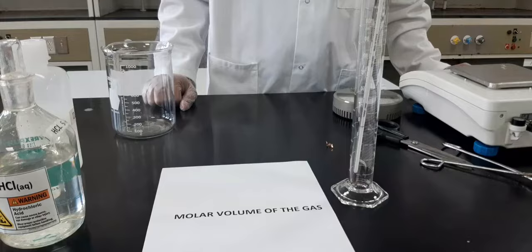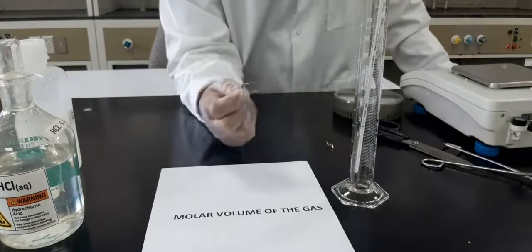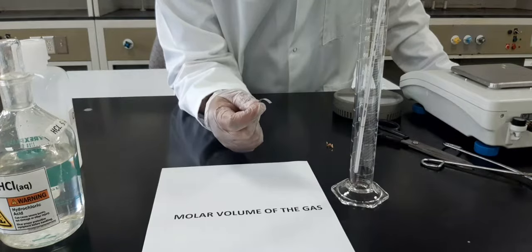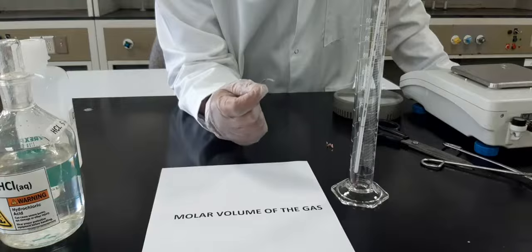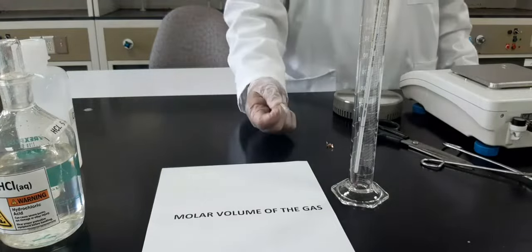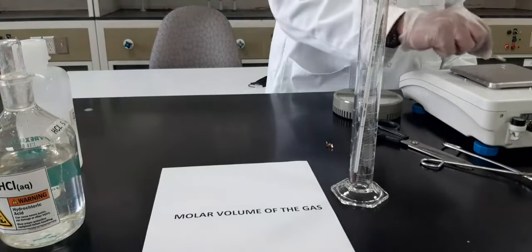First of all, you need to find out the mass of the piece of magnesium. It should be in between 0.07 to 0.09 gram. Make sure it does not exceed 0.09 gram. So we're going to weigh it in the analytical balance. Make sure it's 0 in here. Put it up there.